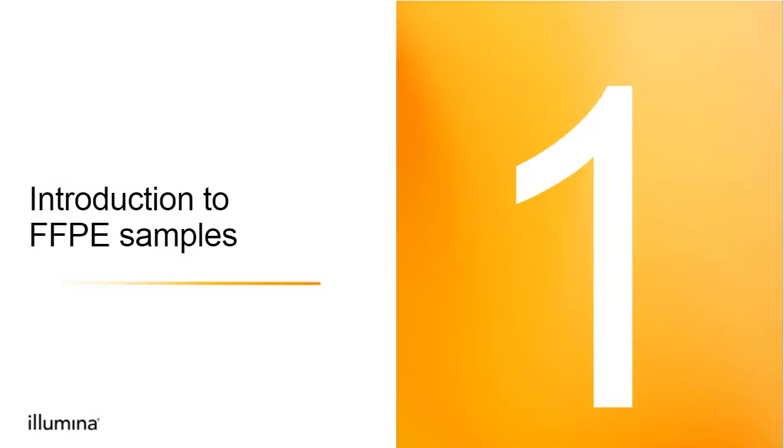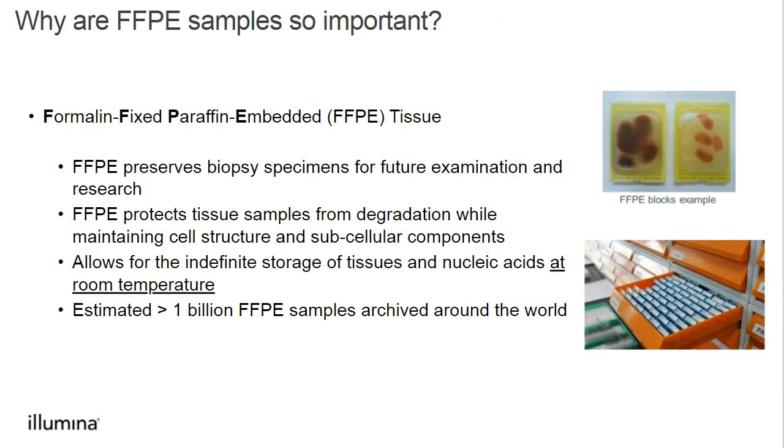So let's move on to our introduction to FFPE samples. FFPE is used for non-sequencing applications, such as in diagnostic and drug development, and it allows us to monitor diseases over time.